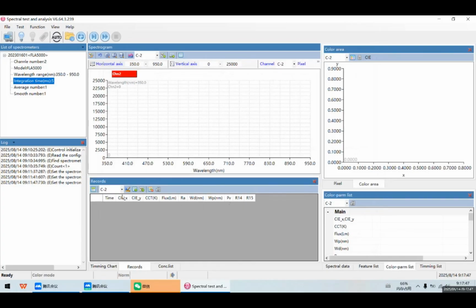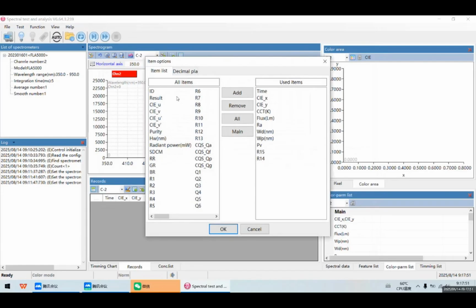How to operate it? Let's take a look. First click on this project option. Some will come out here. You can also see the names of some project options appear here, including a project we have added now. The left side is the addable items.